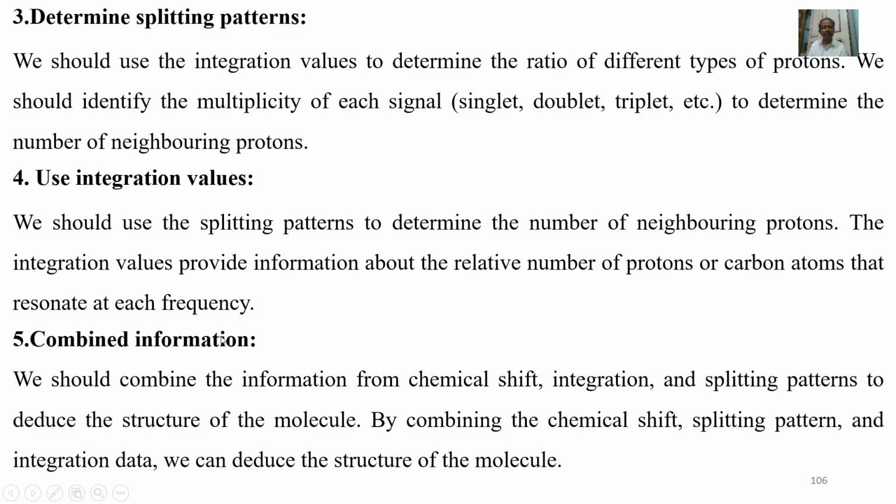Combined information. We should combine the information from chemical shift, integration, and splitting patterns to deduce the structure of the molecule. By combining the chemical shift, splitting pattern, and integration data, we can deduce the structure of the molecule.